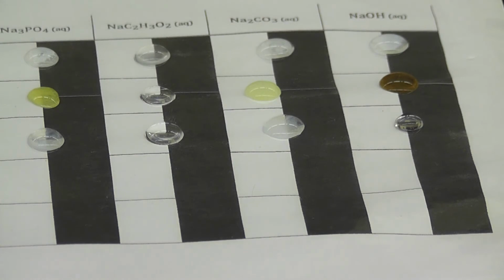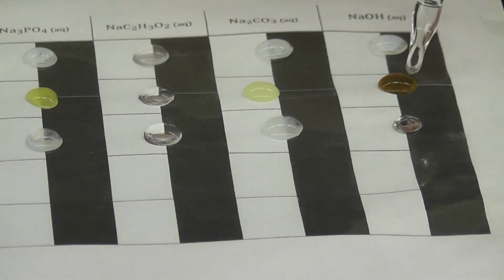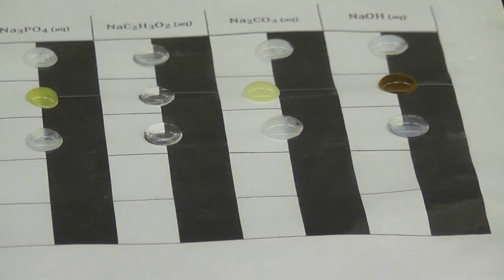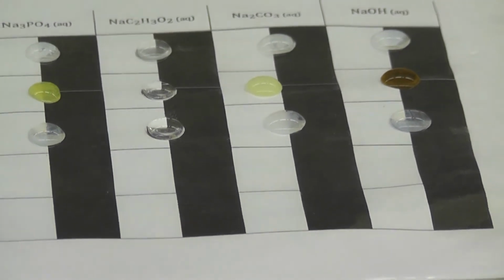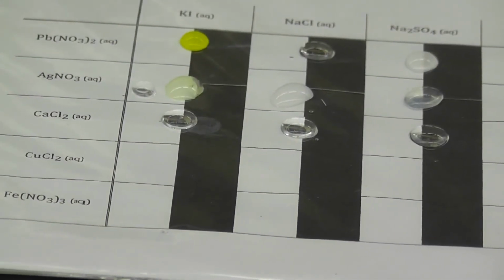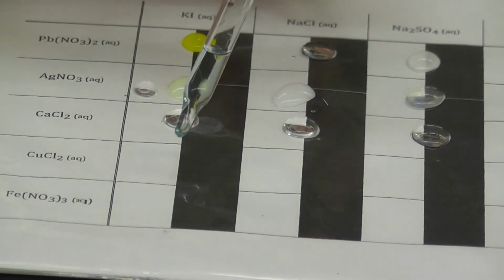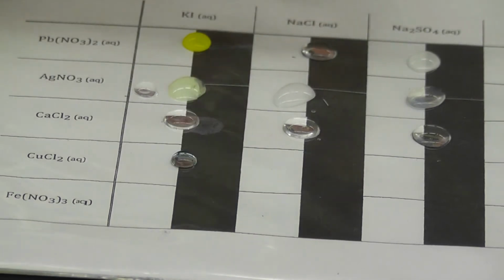Okay. And lastly, we're adding the sodium hydroxide to the calcium chloride. 1 drop of sodium hydroxide. There we go. Okay, so this next line is the copper 2 chloride. So I'm just going to do the same thing, go through and put 1 drop on each one in the middle. 1.